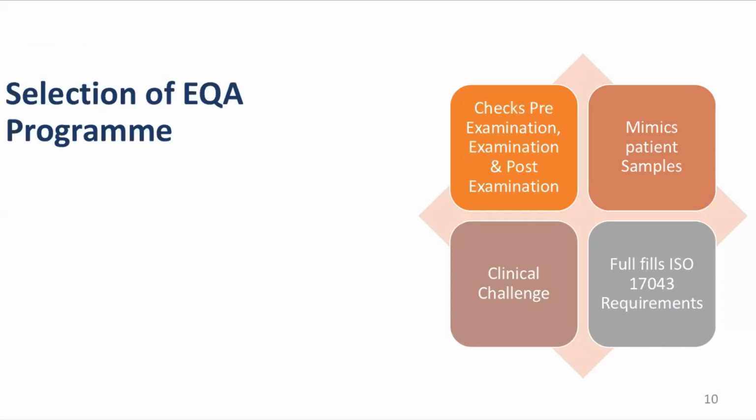And whatever EQAS scheme you are selecting, you have to see, if possible, that it is checking all three: pre-examination, examination, and post-examination. And here remember one thing: suppose you are in an EQAS system, you are uploading data on their website, and there is an error in the uploading of data.